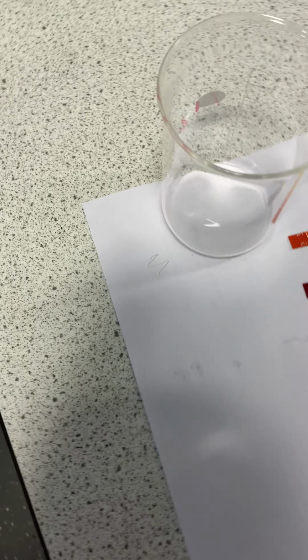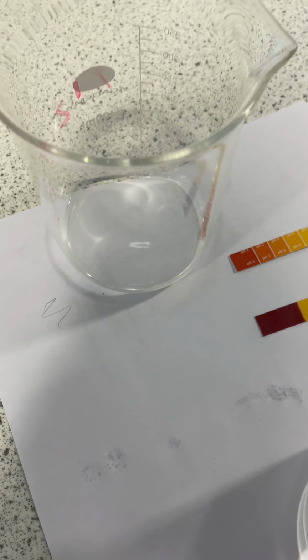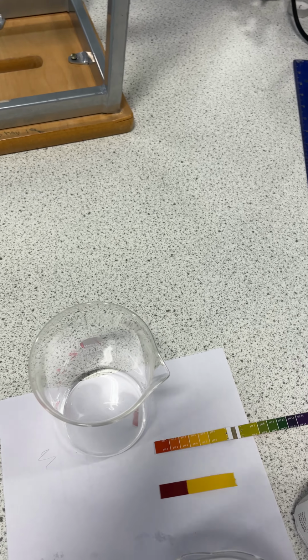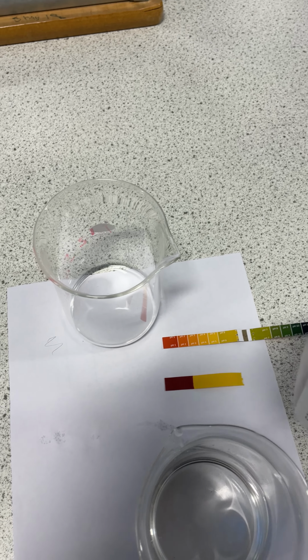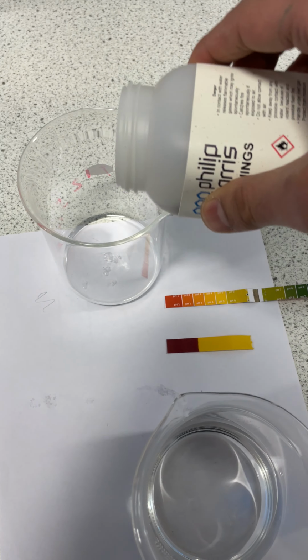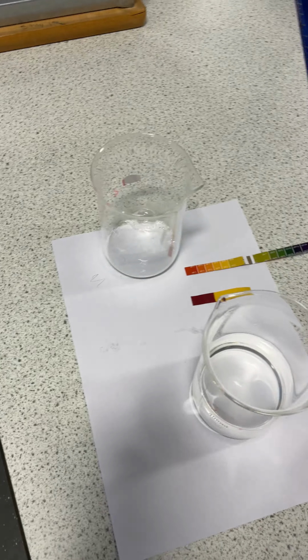What I'm gonna do now is add the acid to an empty beaker, just a little bit. And I've got some magnesium here. So I'm going to add metal to a little bit of acid. Now those of you that have done the metals and acids topic know that a metal and acid makes a salt and hydrogen. So add a little bit of metal, got quite a bit of fizz in there, bit of gas being given off.